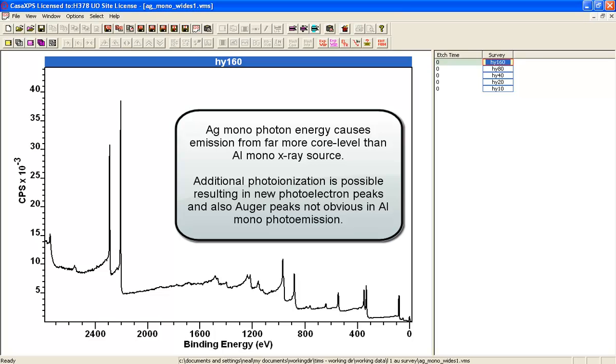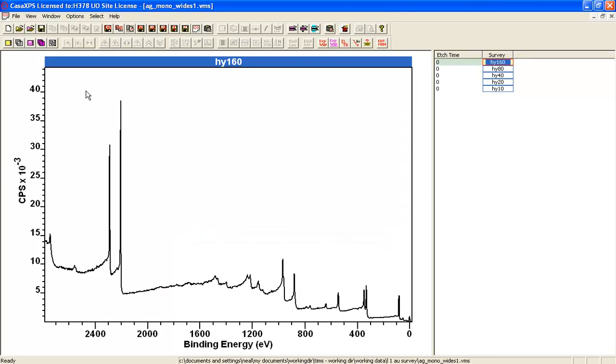This is an example of data measured from a silver monochromator. There are many peaks in this spectrum, many more than you'd see from aluminum.